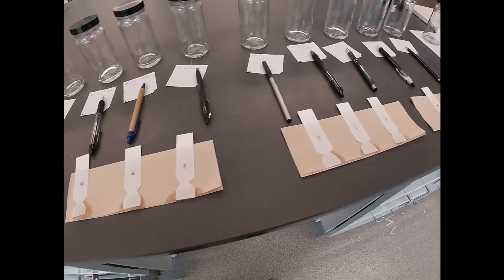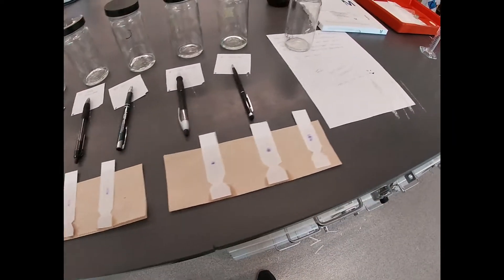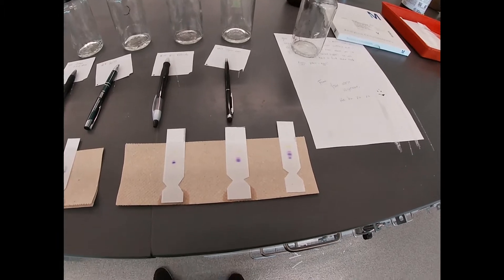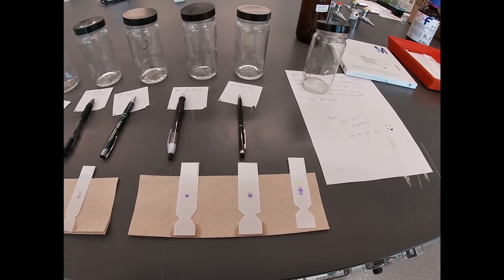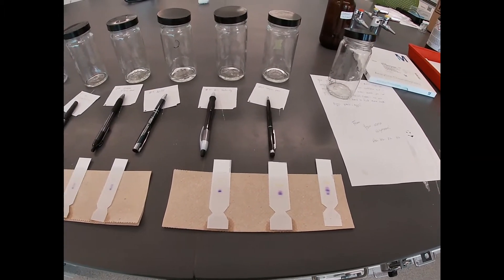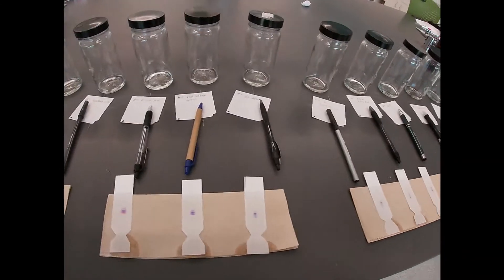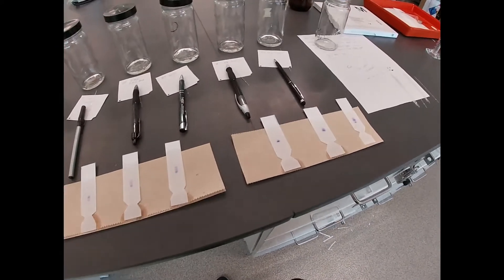So we have our solvent front marked on each of these. Now we're letting them dry, and we'll do some measurements to get our RF factors. Meanwhile I'm going to use the Sharpie up at the very top of each of these to put the number actually on them.